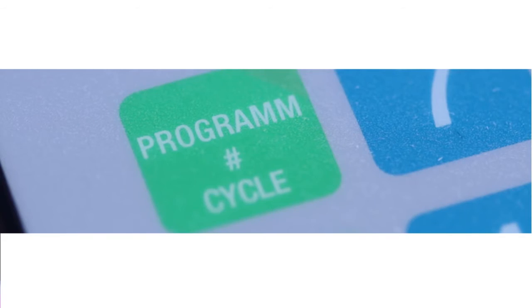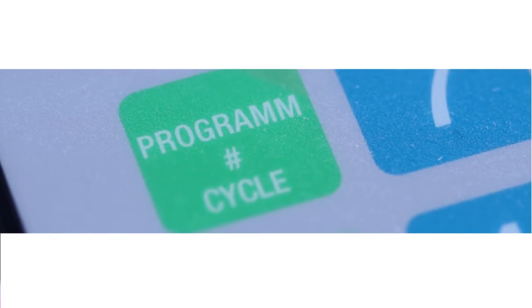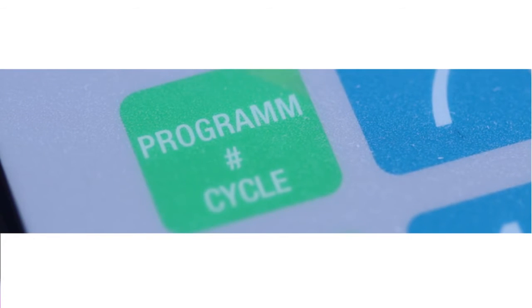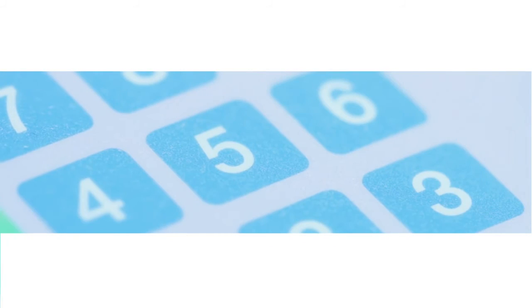That's it! Should you need to check your settings, press the program button on the top left and the corresponding program number. Your setting parameters should be displayed in sequence.